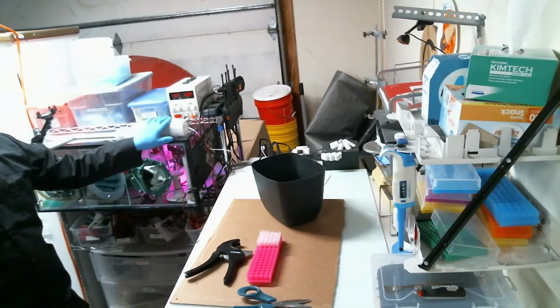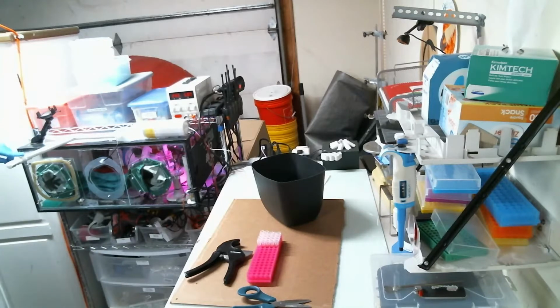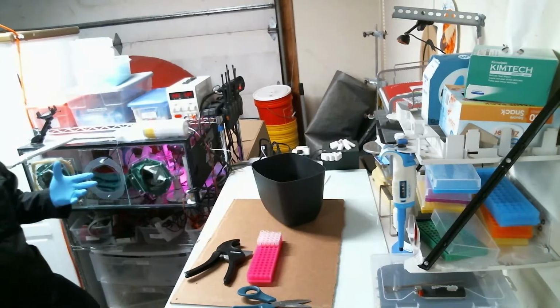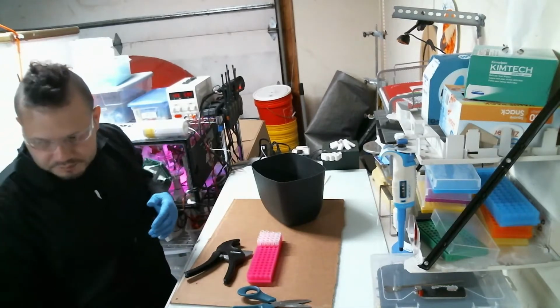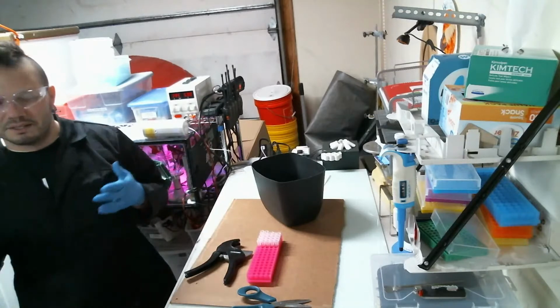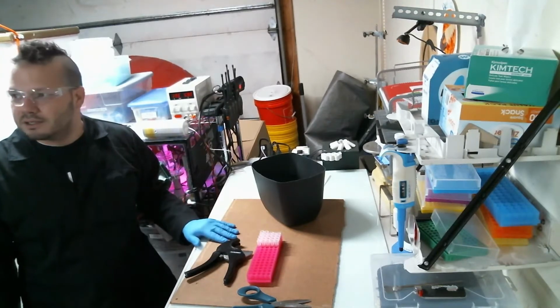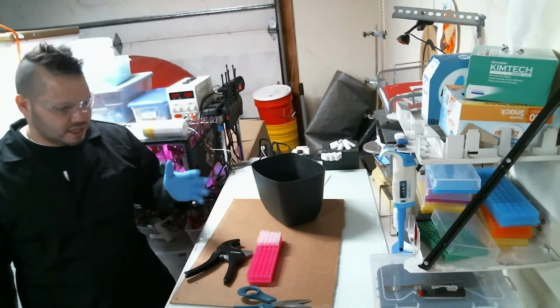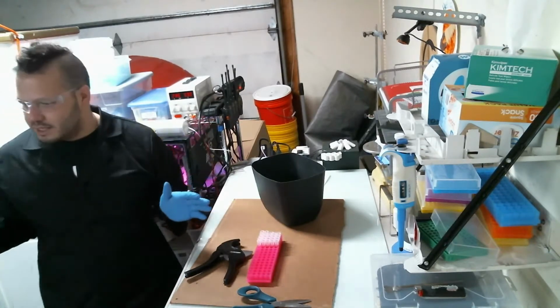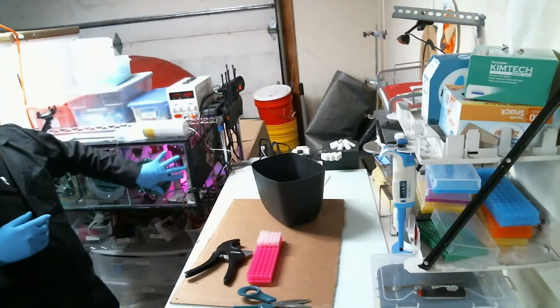This is an air filter which goes through here into here. It's a HEPA filter, and it filters out all the dust and impurities, because obviously this is a garage, so no matter what, you're going to have some kind of dust collection and so on. Of course you try to clean everything as much as you can, but in here it filters out that way.